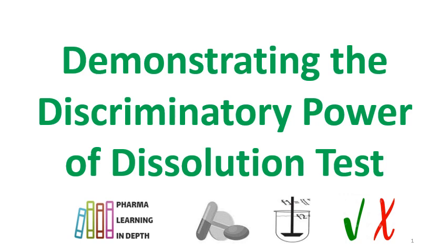dissolution is a performance test, as we know, and if the dissolution test is not discriminating between the batches, then it will be difficult to prove that the commercial production is sending the batches into the market which are safe and efficacious. So from the bioequivalence, safety and efficacy perspective, dissolution becomes a very important test.